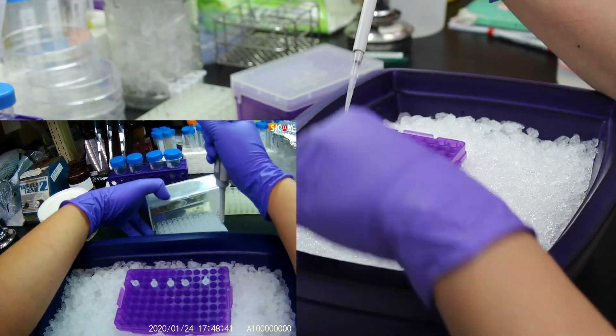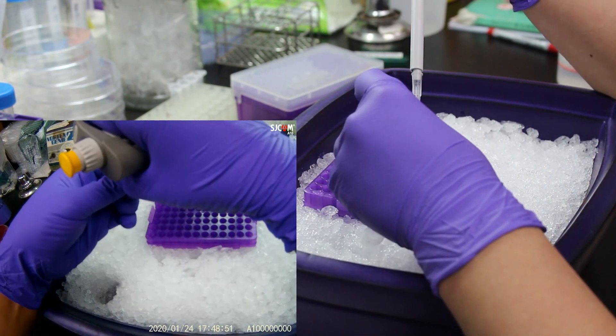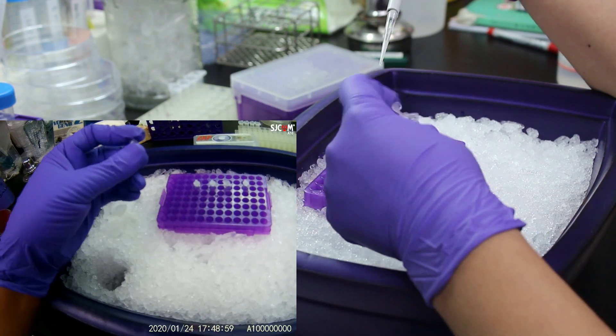Next step is to distribute the PCR mixture we have into each PCR tube. In this case, 15 microliters for each tube and a total of five tubes.